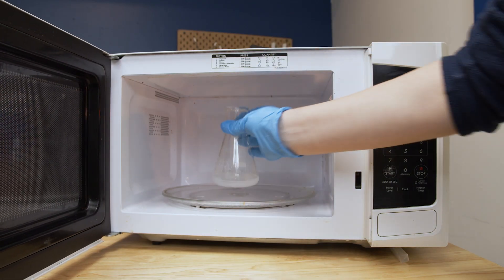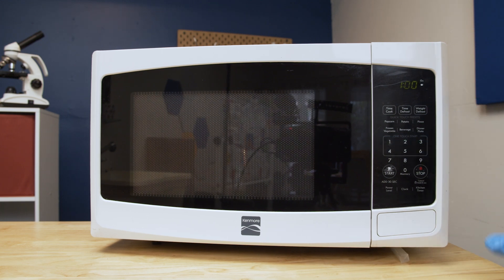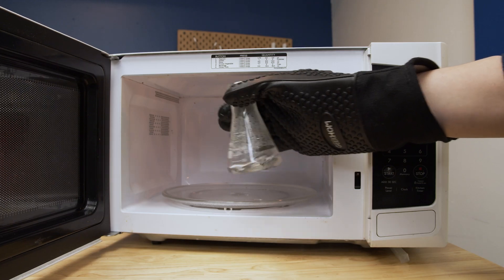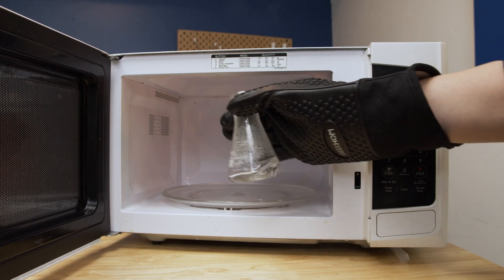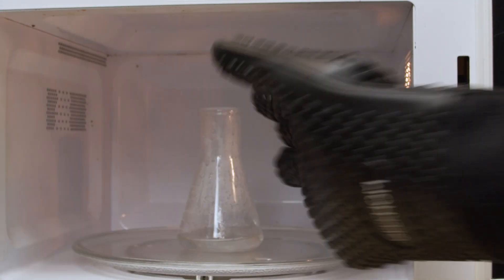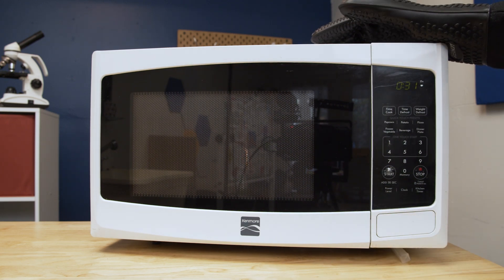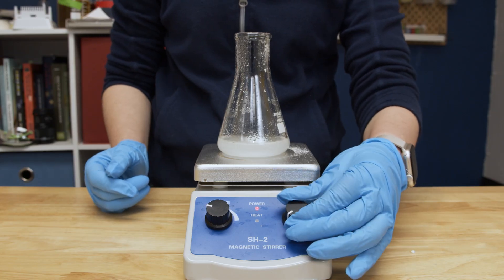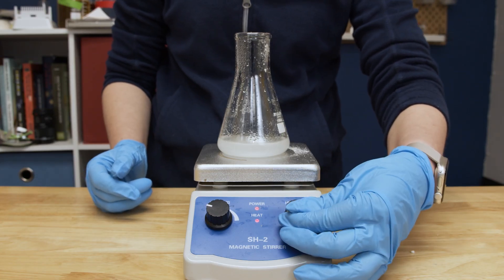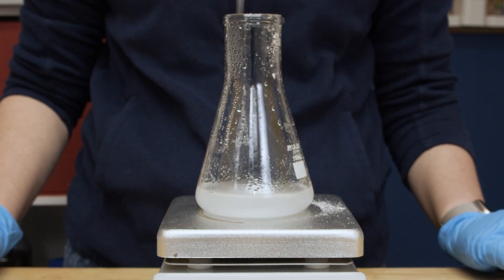Heat in a microwave for 60 seconds or until the solution boils. Keep an eye on it to make sure it doesn't boil over. Swirl using a heatproof mitt to make sure that the solution is well-mixed. Make sure that all of the agarose crystals have dissolved. If agarose crystals remain, microwave for another 5 to 10 seconds, then check again. You can also use a hot plate if a microwave is not available, but this will take longer. Ensure that the agarose tab has broken up before heating.